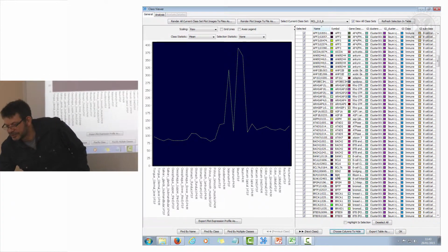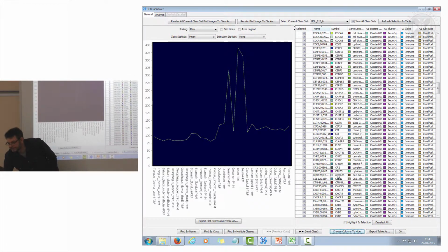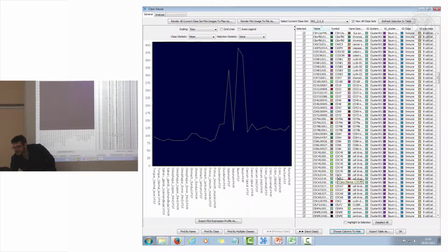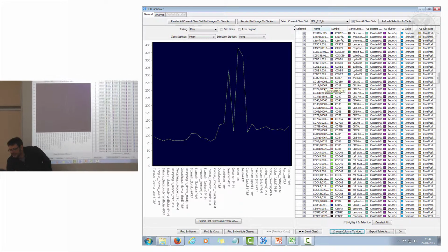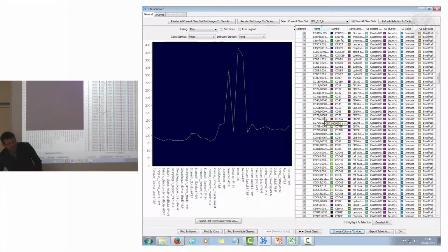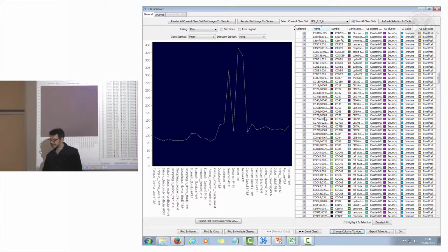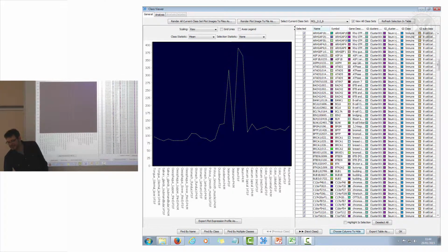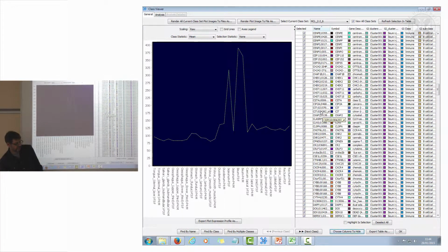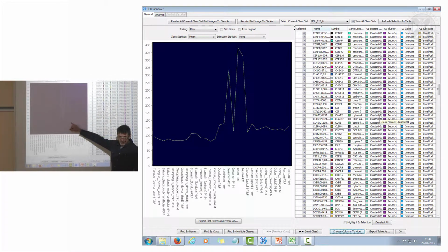Just going down here, we get past the ones which are unannotated. Let's find some CD antigens. So CD19, CD22, CD40, CD72. So that's a B cell signature, if ever I've seen one. But there's also other things going on here, and you'll also see that very familiar signature that we looked at just now, which is the cell cycle signature. Okay? So what we've actually captured here with this biggest cluster is immune biology of the gut.